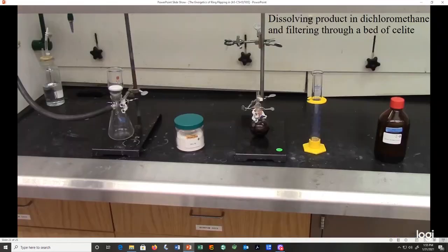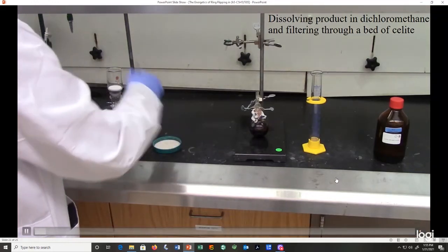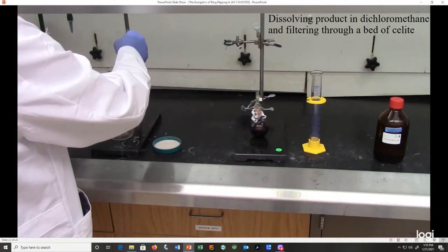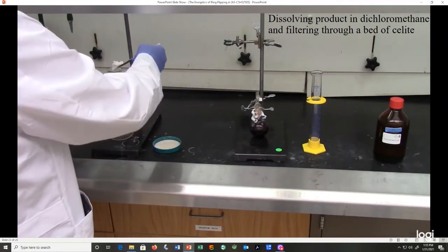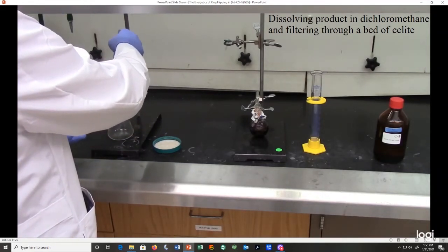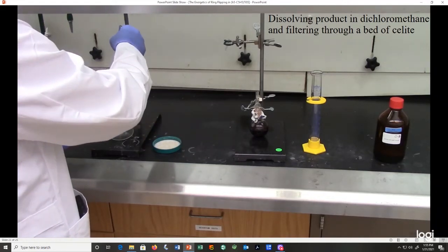Now we're ready to dissolve the product in dichloromethane and filter it through a bed of Celite. The reason we're going to do this is we want to get rid of as many impurities as possible, and our product will be really soluble in dichloromethane, but some of the impurities may not be as soluble, and they can get trapped in the bed of Celite when we filter it.